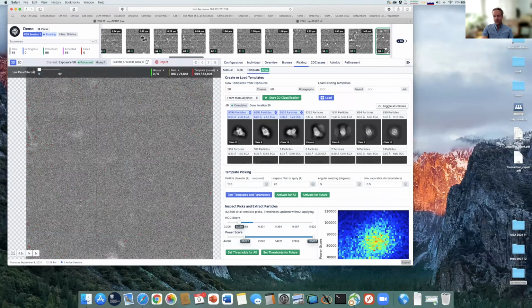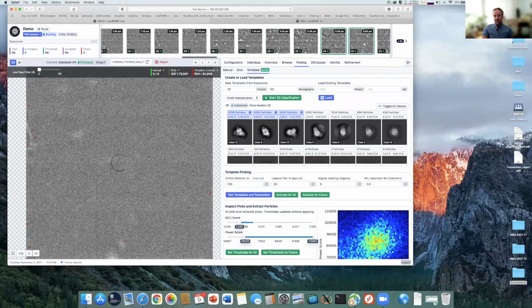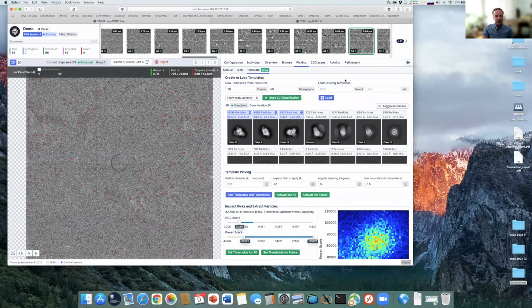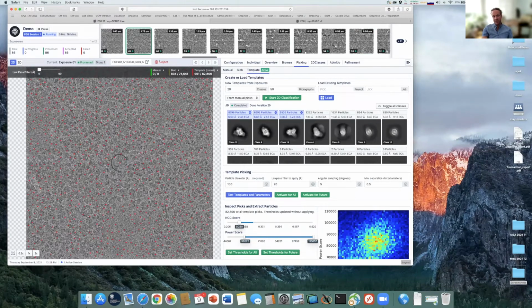And then that one's totally empty. So I just like to look through a few micrographs, make sure that my picking is good, looking at different defoci. So for example, that's 0.86 versus 1.8. You can see we've got a lot more contrast in the 1.8. Again, you can see the ice is really nice and thin. I've got these little patches with no particles.